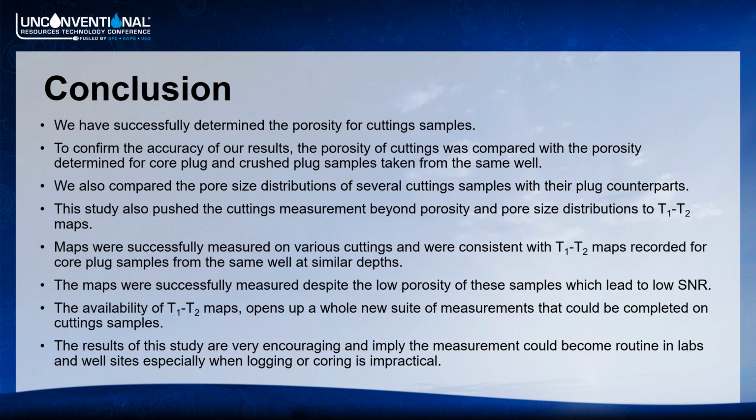In conclusion, we have successfully determined the porosity of cuttings. T2 distribution comparison of cuttings versus plug data suggests that cuttings can be used for pore size distribution determination. And T1, T2 maps acquired on cutting samples opens up new opportunities in unconventional sample analysis.